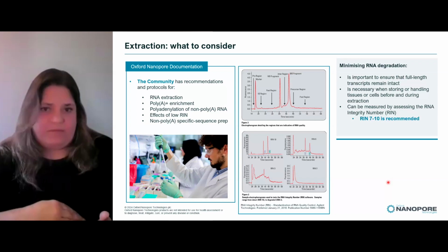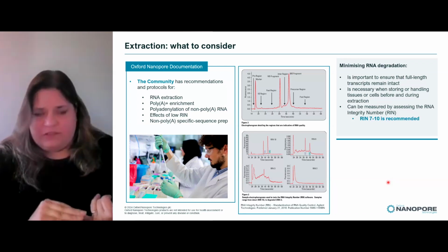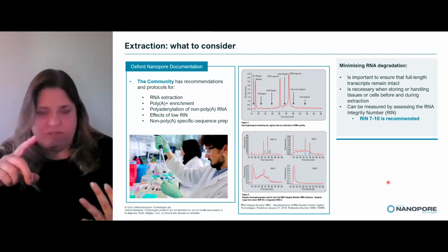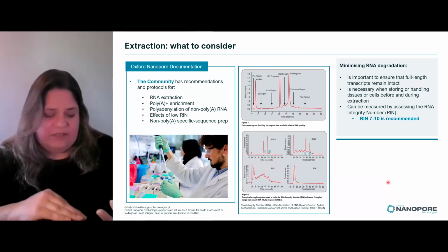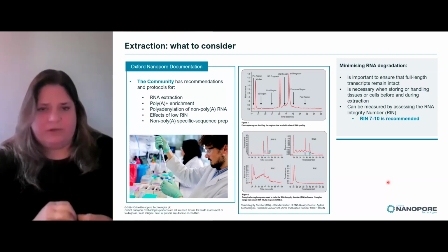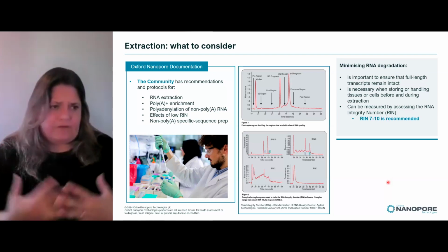Each one of them is important because they each represent a gene that's been transcribed, so you can look at the levels of transcription, whether or not this gene is highly turned on or turned off, or which isoforms are being used. So everything is important. You want to make sure that every isoform and every transcript is full length so that you know what it is that you're looking at. So very important.